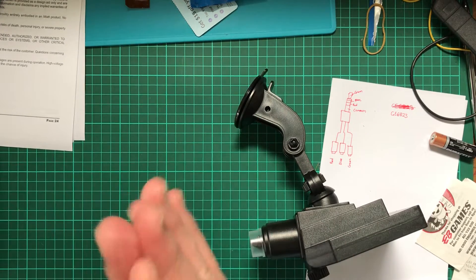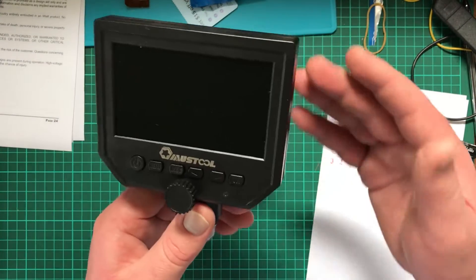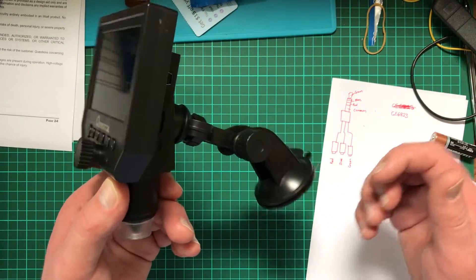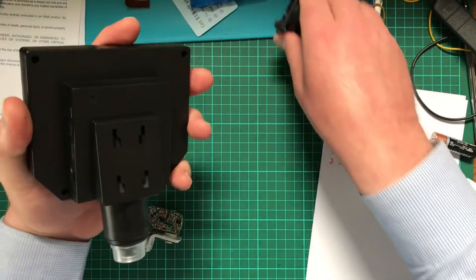It's been some time since I last posted a video specifically about this, but I wanted to do a follow-up today. While I haven't used this as much as I want to — for instance, I wanted to try to do some desoldering — I haven't actually been able to sit down and do that yet. I've had some rather irritating problems.